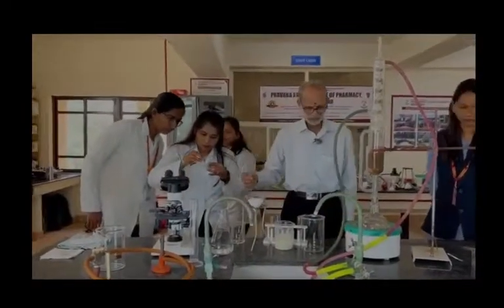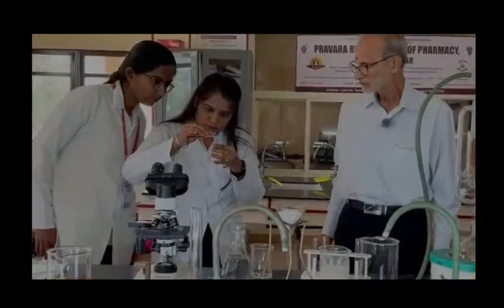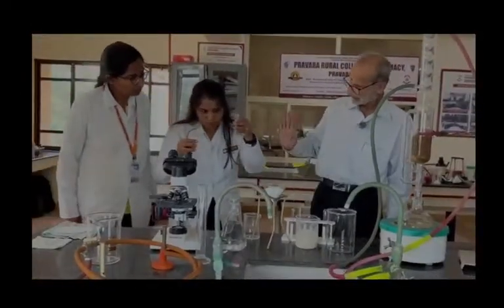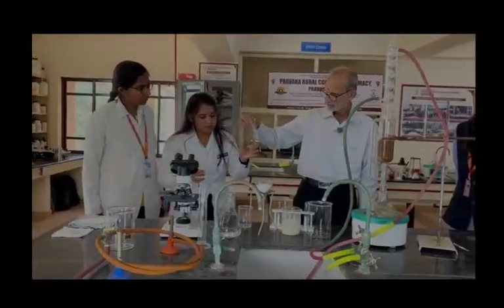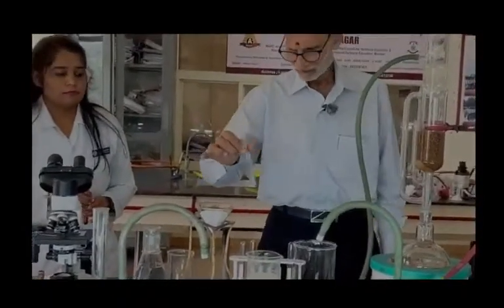Do you have a dropper? Okay. We can test it. So she is putting the suspension and then the iodine solution. Yes, it has become purple. Starch will actually become purple in color. So now you can see it has become purple. Whatever we separated has become purple.